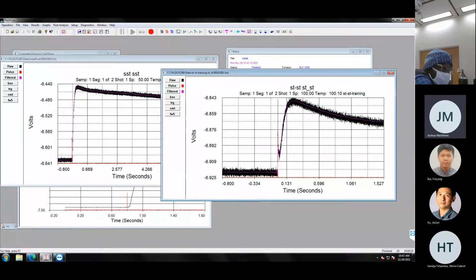Exactly. So if you have glass, you'll see that, and you can try and coat it with graphite spray, but that might not adhere nicely to something that's very smooth like glass. It might need a porous surface to adhere to. In that case, the applications folks usually recommend to sputter coat with some sort of high diffusivity material, and then coat with graphite spray to absorb the light coming in.